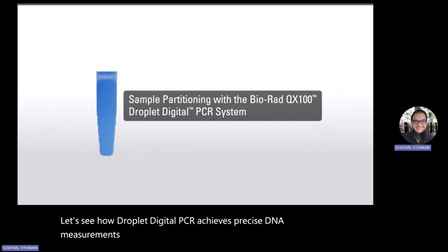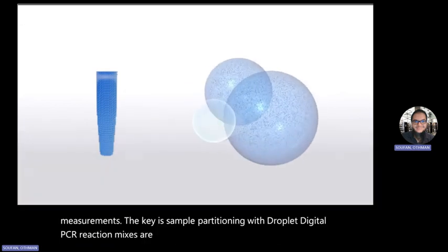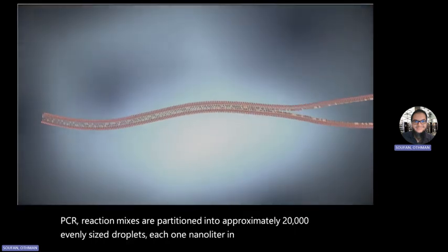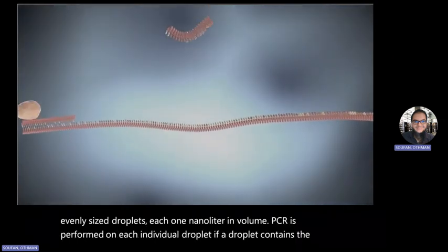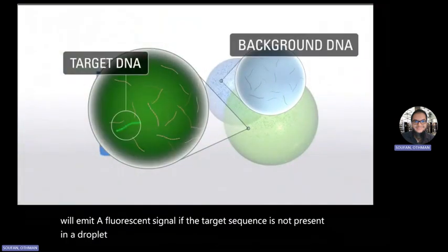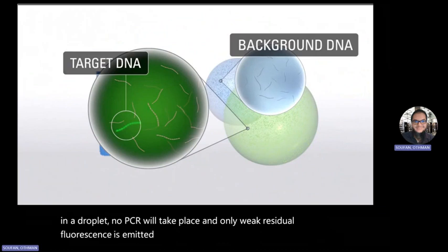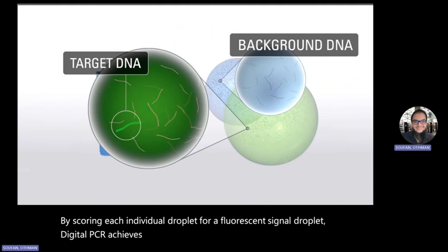The key is sample partitioning. With droplet digital PCR, reaction mixes are partitioned into approximately 20,000 evenly sized droplets, each 1 nanoliter in volume. PCR is performed on each individual droplet. If a droplet contains the target sequence, it will be amplified and a TaqMan reporter dye will emit a fluorescence signal. If the target sequence is not present in a droplet, no PCR will take place and only weak residual fluorescence is emitted. By scoring each individual droplet for a fluorescence signal, droplet digital PCR achieves absolute quantification with a high level of precision and single molecule sensitivity.